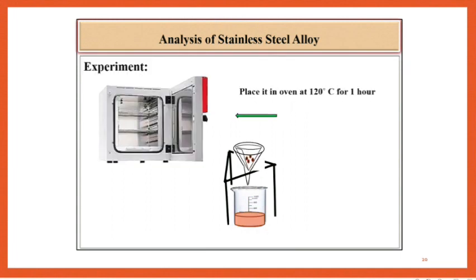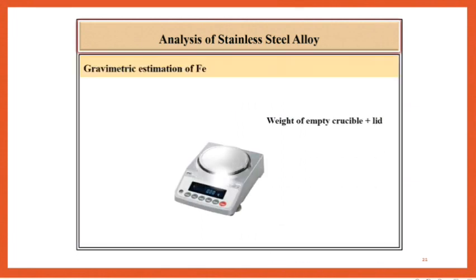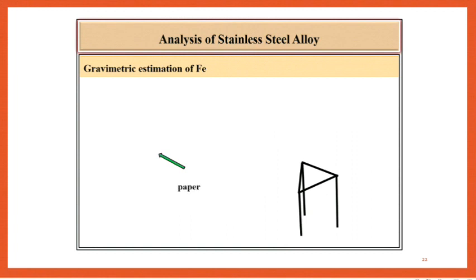Dry the precipitate of Fe(OH)3 by placing it in an oven at 120 degrees Celsius for 1 hour. Meanwhile, take the weight of the empty crucible with lid. Then incinerate the filter paper along with residue by folding and fixing with a pin.